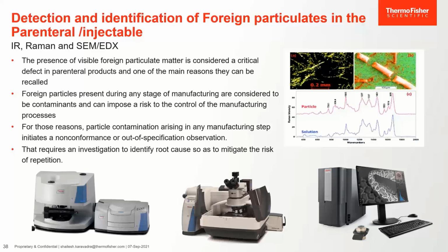The combination of Raman and SEM-EDS allows a comprehensive understanding of the many different types in a sample population as a whole. This includes organic, inorganic, and metallic particles. EDS with FTIR allows us to see subtle differences in trace elements present in test articles that are made of similar chemicals, for example.